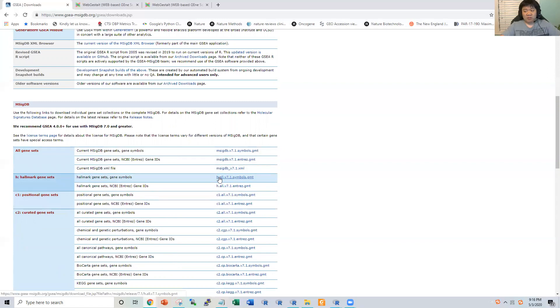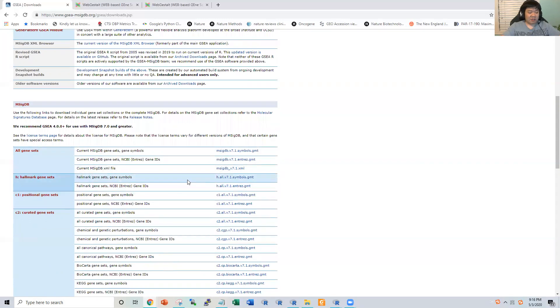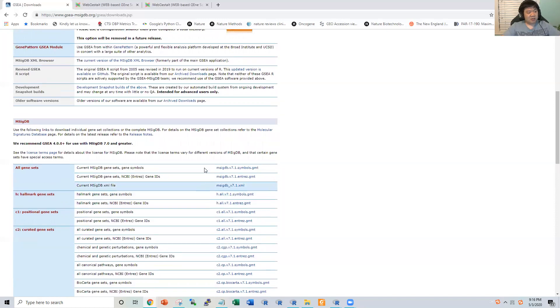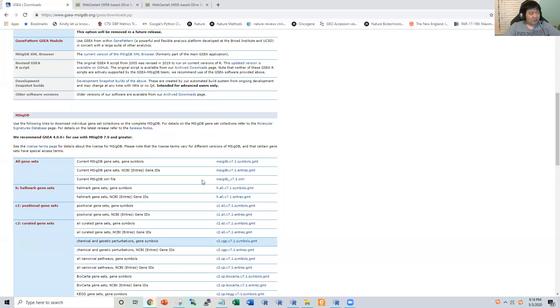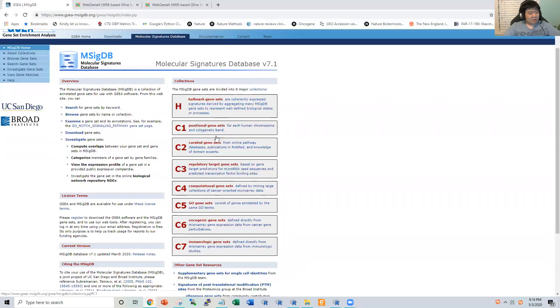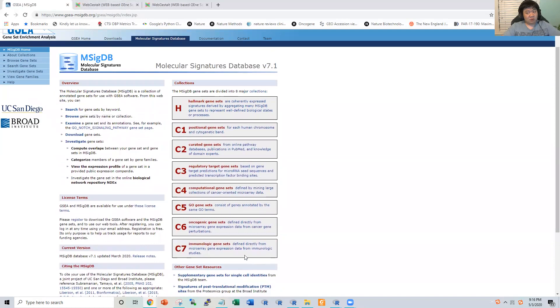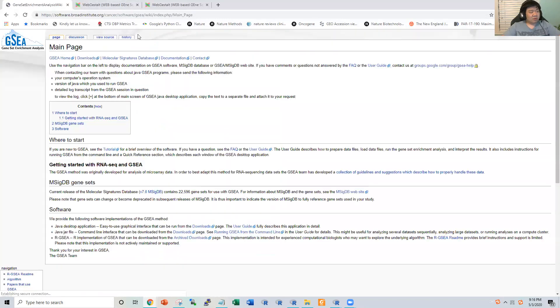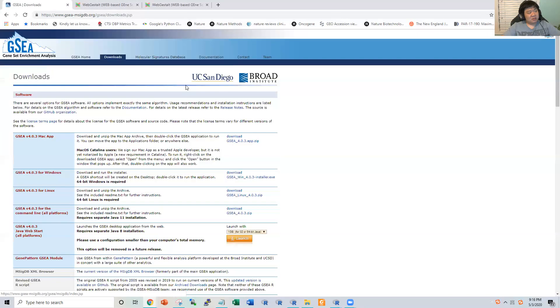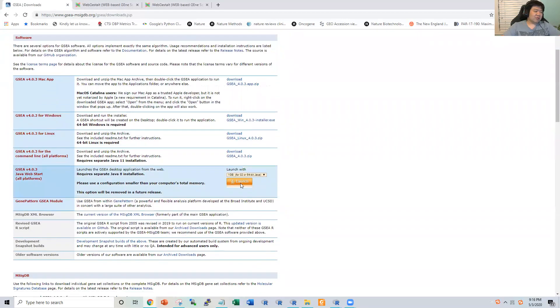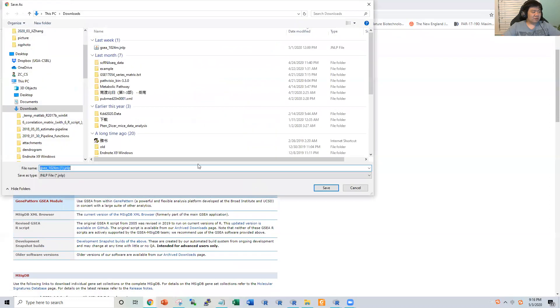They also keep tracking information of version six and past versions because certain published results were based on past versions, and to ensure reproducibility they keep old versions available. This is the molecular database — you can see more descriptions of each molecular signatures gene set from here. And there are also documentations. Today we are majorly focused on the hands-on application of the Java version of GSEA, which you can download and launch from here.